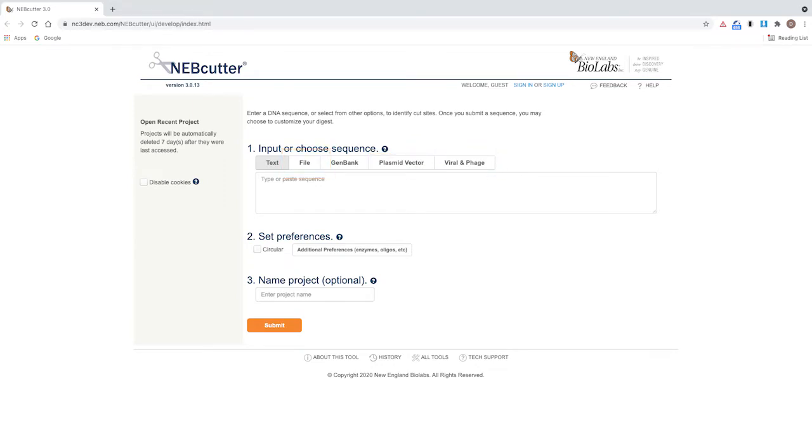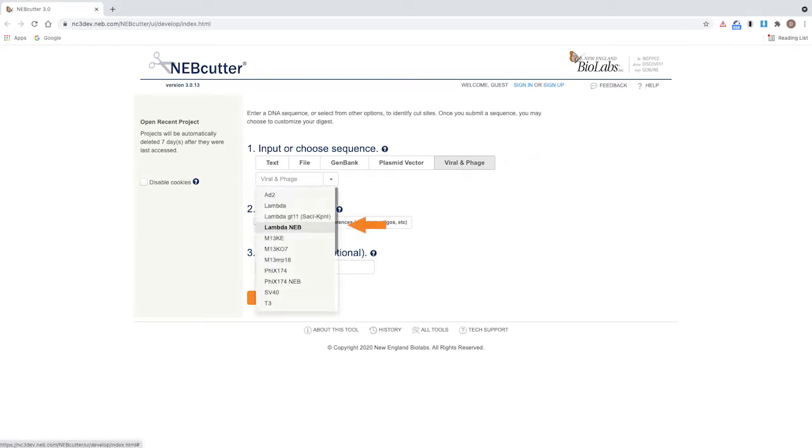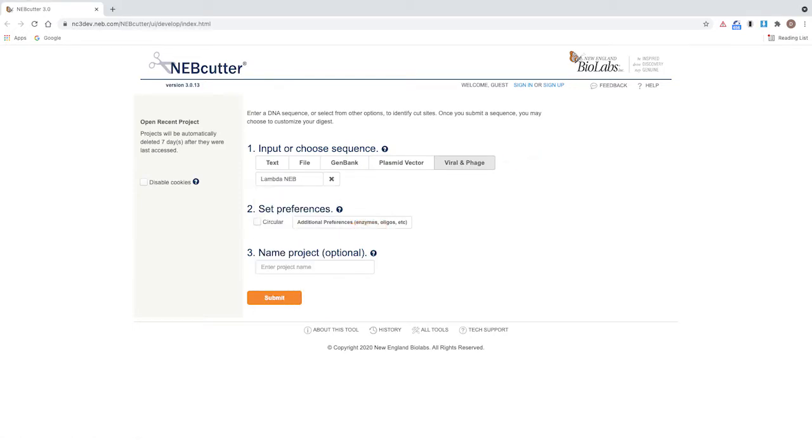Let's visualize a virtual digest of the lambda phage genome. Click on the viral and phage option and select lambda NEB from the menu. Lambda DNA is linear, so leave circular unchecked. Click submit.